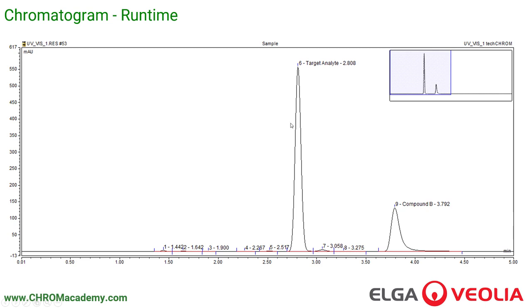It's a very accurate and precise technique. If we were to inject this sample again and again, we'd pretty much get exactly the same retention time. We've got a second compound here which has taken longer to come out of the column — about 3.792 minutes. We've taken two substances which chemically are very similar, but we now have them separated out. And that's HPLC.